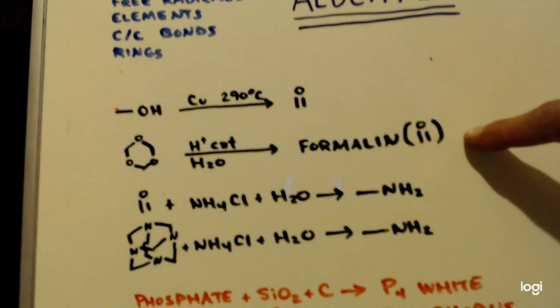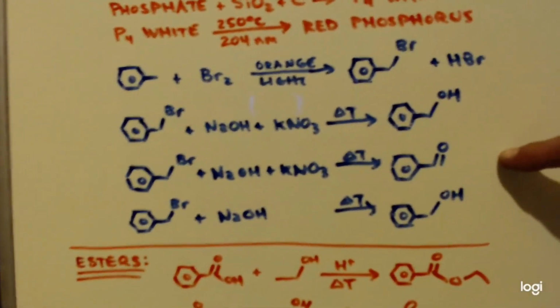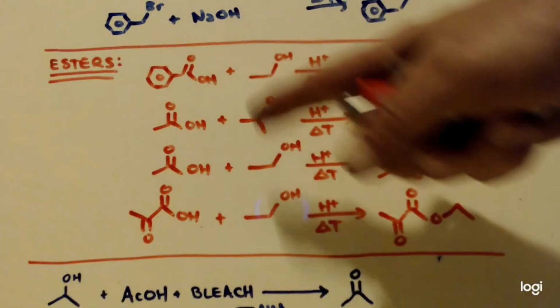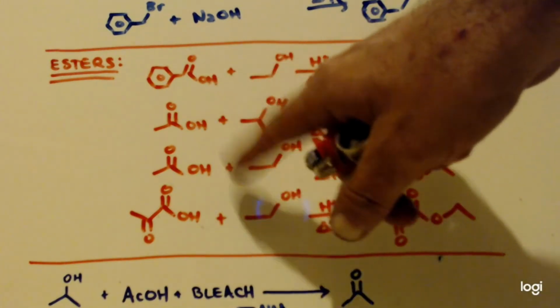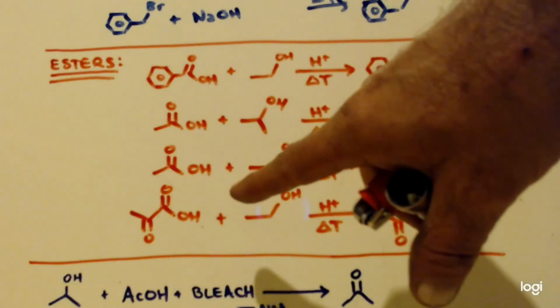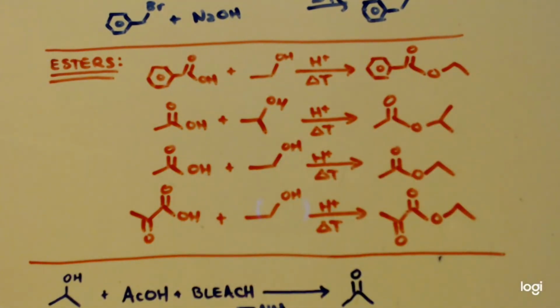And keep in mind, if I can make the formaldehyde up here and the acetaldehyde, then I'll be making benzaldehyde with 3 aldehydes. So I'll make some esters, benzoic acid, and ethanol. These are acetic acid and alcohols to make these appropriate esters. That's pyruvic acid and ethanol to make this ester. And I've made esters before, so my yield should be at least 85 percent or up. But we'll see. And then I also want to hydrolyze these. Once I make them, I want to hydrolyze them back into the carboxylic acid and the alcohol.